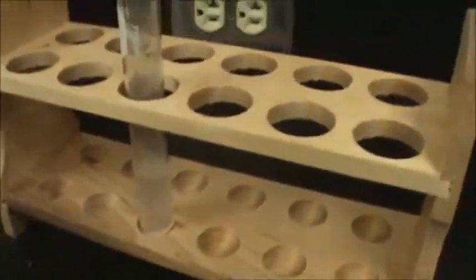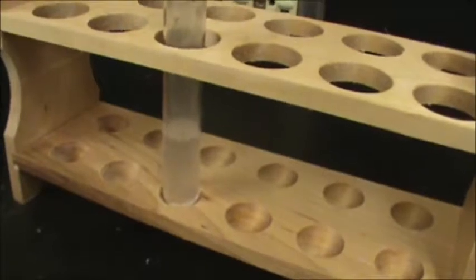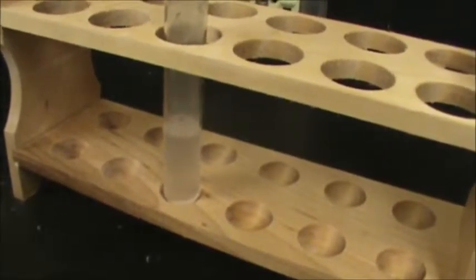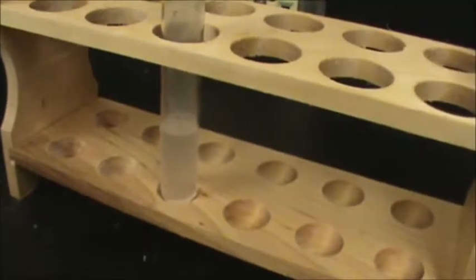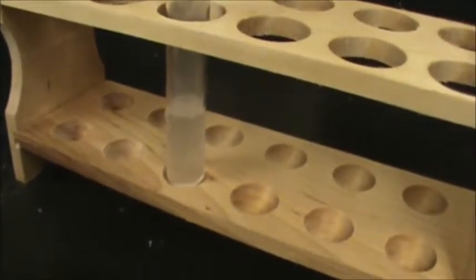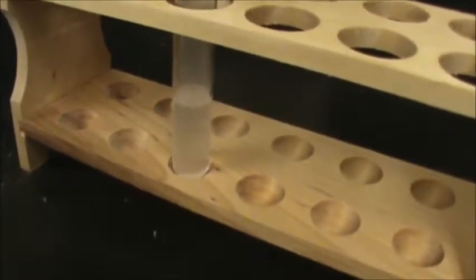So, we got 3 gases that we should be aware of. One of these gases does something to wooden splints. We just saw it reignite and glow brighter. So, think about which gas is present in this reaction. Alright, if you still don't know, Google it. You probably will figure out what the gas should be.